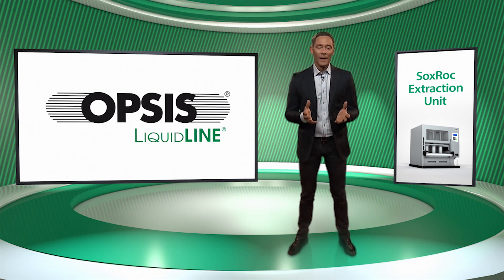The OPSIS LiquidLine SoxRoc Extraction Unit has a solid construction and includes several built-in safety features. We will show you some of these unique safety solutions before we take a closer look at how the instrument is used.